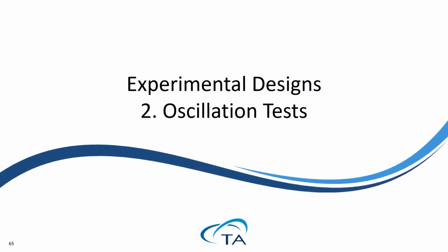Now we have finished discussing all flow procedures for viscosity measurements. In the next section, we're going to discuss the oscillatory test method for measuring the viscoelastic property of a material.